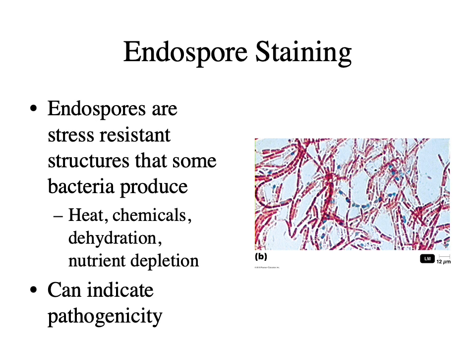They're able to produce endospores to protect their material and kind of wait until the conditions are better for them. So we can do an endospore stain in order to see if our bacillus has an endospore. And we use heat to force the bacillus to produce these endospores.